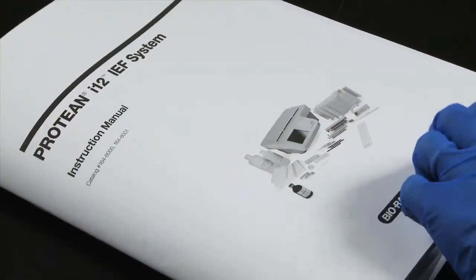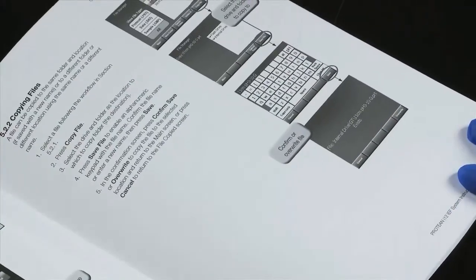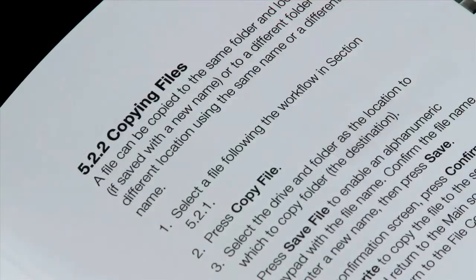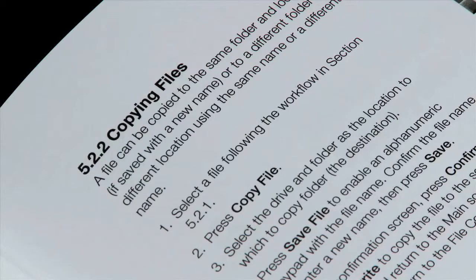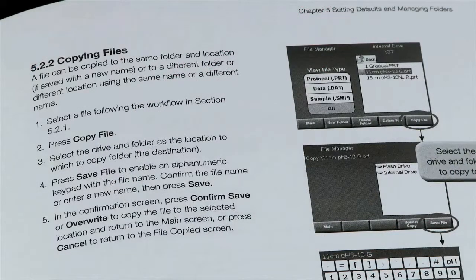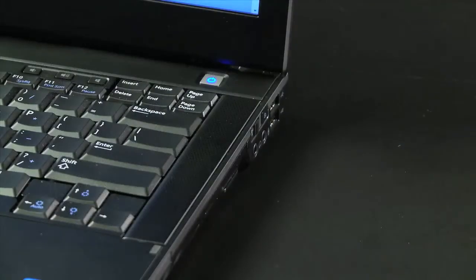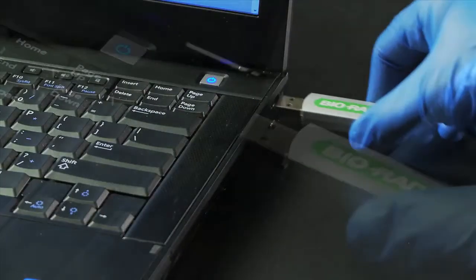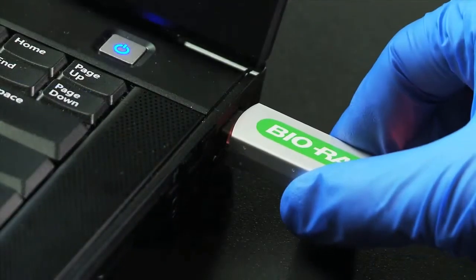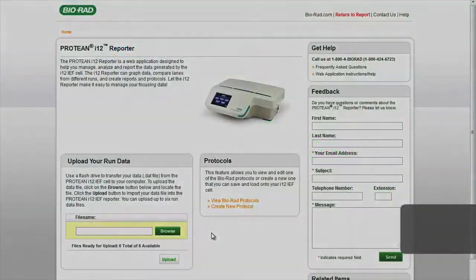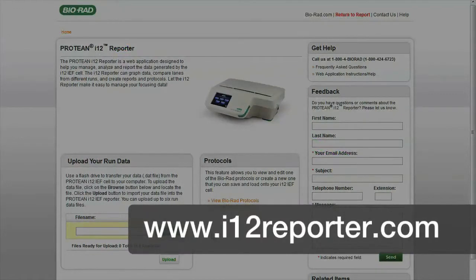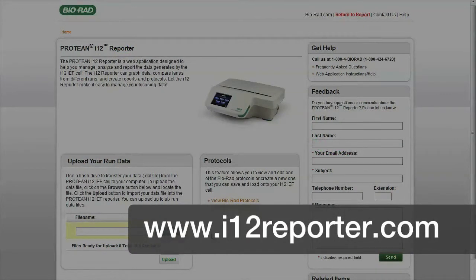See Section 5.2.2 of the manual, Copying Files, for instructions on how to copy run data files to a USB flash drive. Transfer the USB flash drive to a computer, then go to www.i12reporter.com to launch the PROTEAN i12 Reporter application.